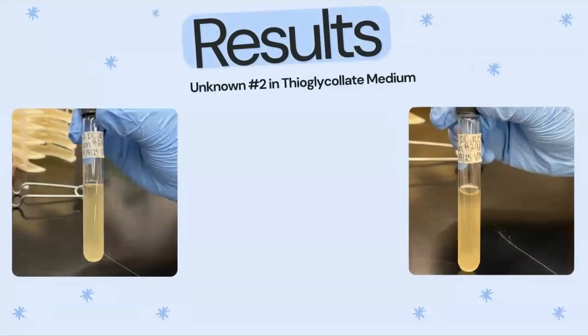Our unknown number 2, however, was not as noticeable, although the liquid medium does seem to have a more cloudy appearance. It was not as visible compared to the cloudiness that was in the previous unknown number 1.